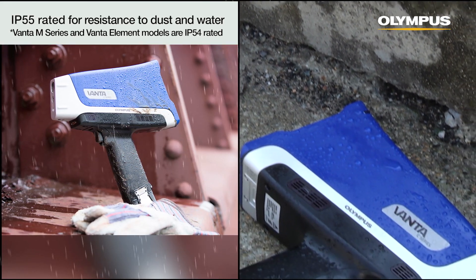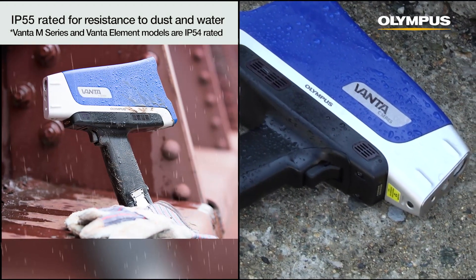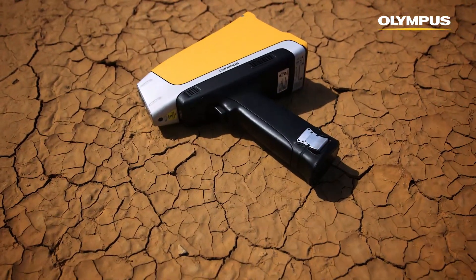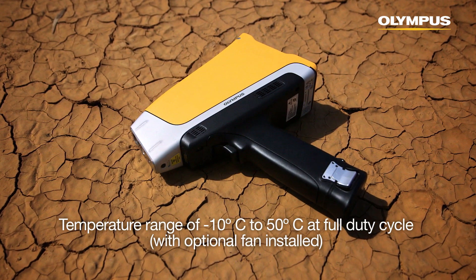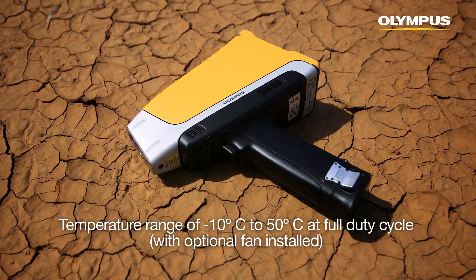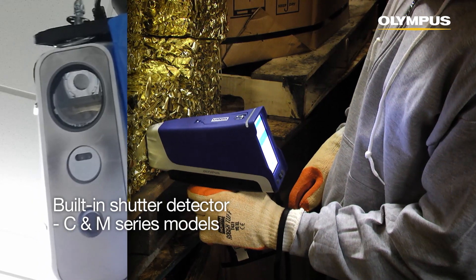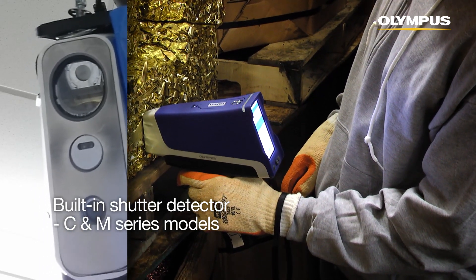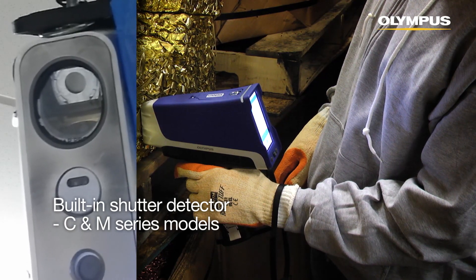For additional protection, the Vanta is IP rated for resistance to dust and water. When testing hot materials or working in hot environments, Vanta can test at full-duty cycle from negative 10 up to 50 degrees Celsius with the optional fan installed. The built-in shutter detector on C-series and M-series models helps protect the x-ray detector from damage and costly repairs, so users can analyze sharp samples with confidence.